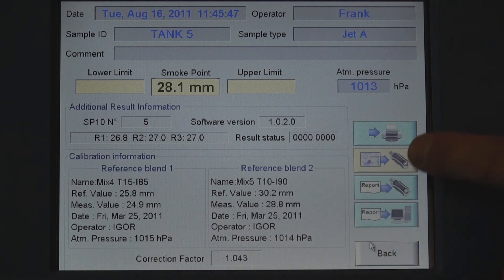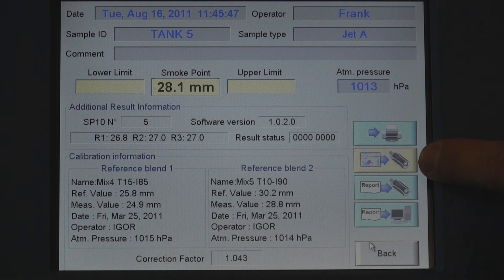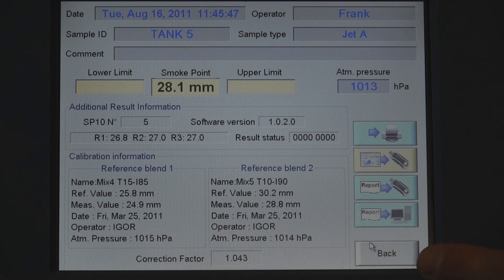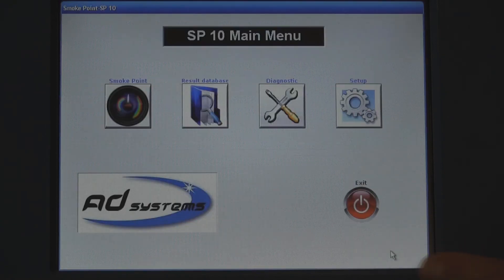Results are saved on board and can be printed, stored on a USB flash drive, or exported to a LIMS system. The technician can retrieve results by touching the results database icon.